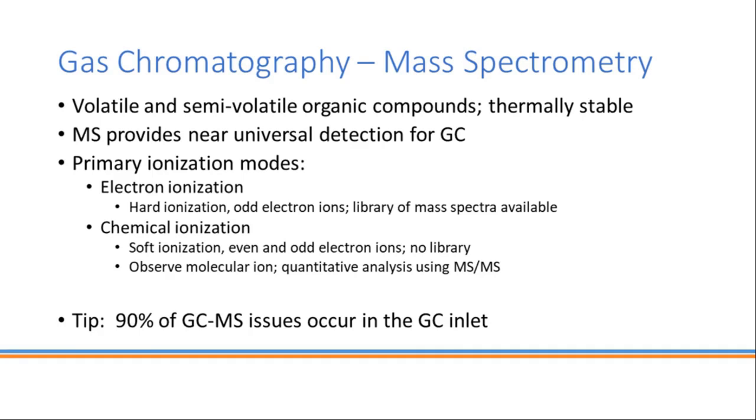And that can be advantageous for quantitative analysis. If we can keep all of our signal in one ion form, and we're going to do something like a multiple reaction monitoring experiment for quantitative analysis after that, we'll have the best sensitivity using an ionization source that puts most of the population of our ions into one signal, versus in electron ionization, we create a lot of different ions. You can still do MS following that, but it's just, again, considerations for what you're trying to achieve.